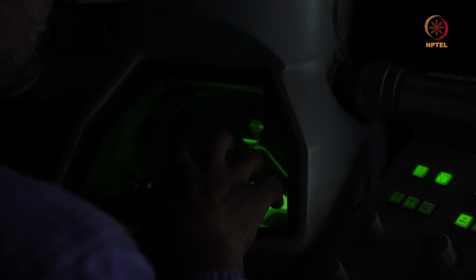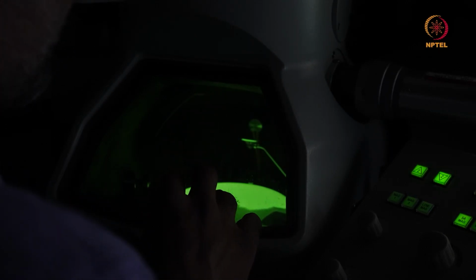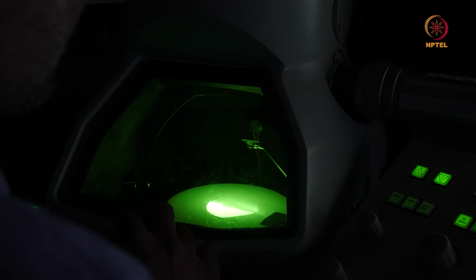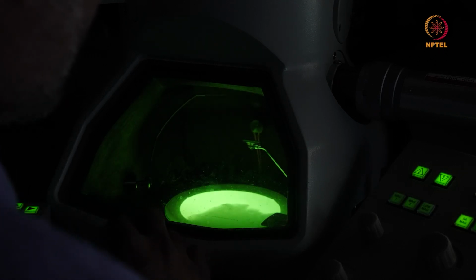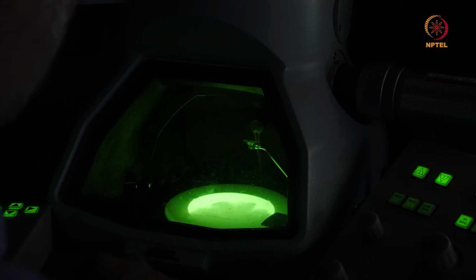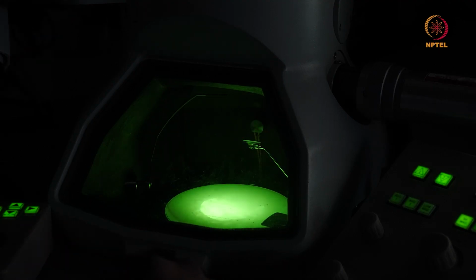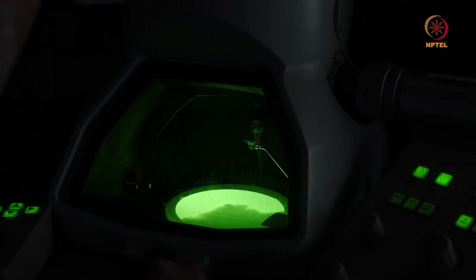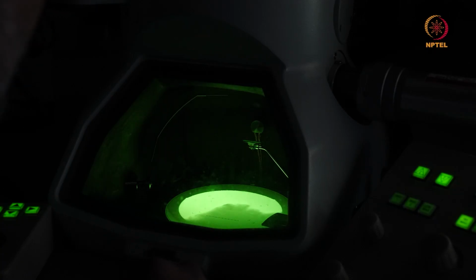In this configuration, as you are not at the eucentric height nor close to the right focus, the specimen appears thicker than it actually is. But in reality, as I converge the beam, squeezing the electron beam by turning the intensity knob to the left or right, this indicates your sample is not at the eucentric height.